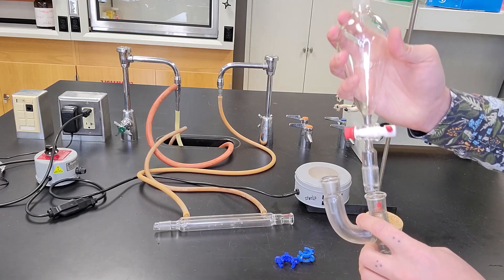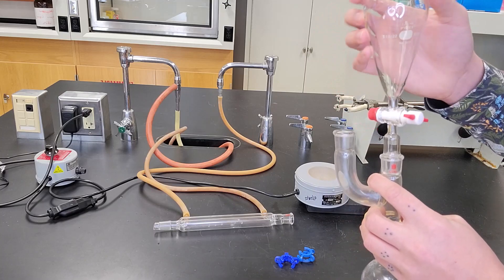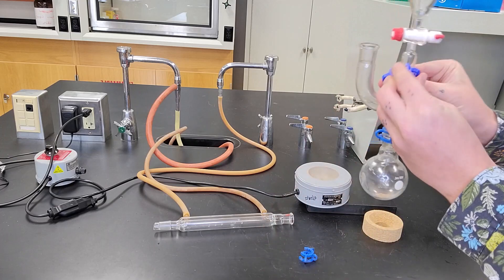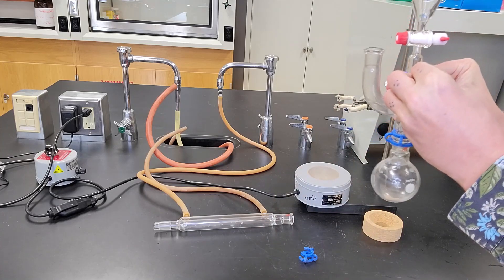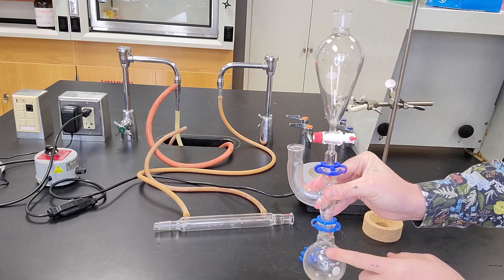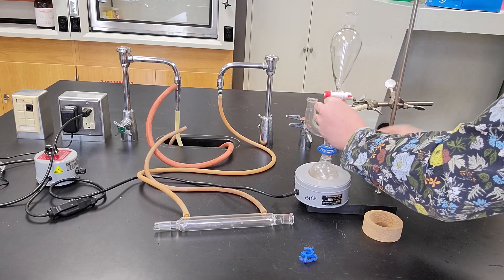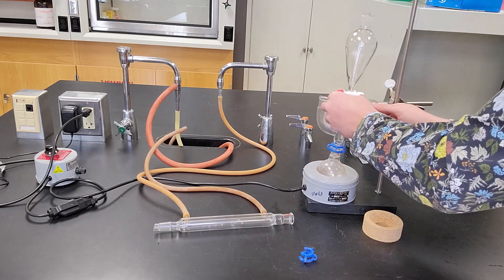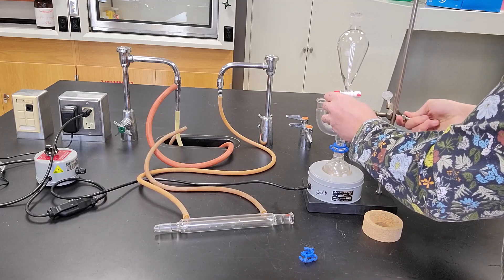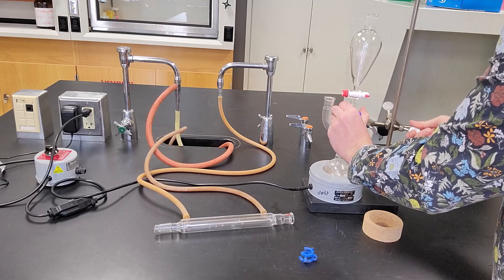So I'm going to take my addition funnel and this is frosted so I can put it on with grease and keck clip it. And I'm going to keck clip this on so we have a tight seal. So we now have the flask with the addition funnel directly above it.